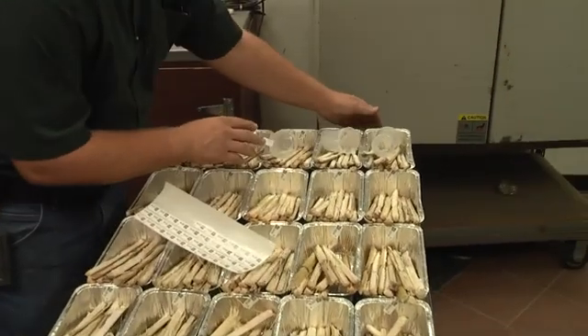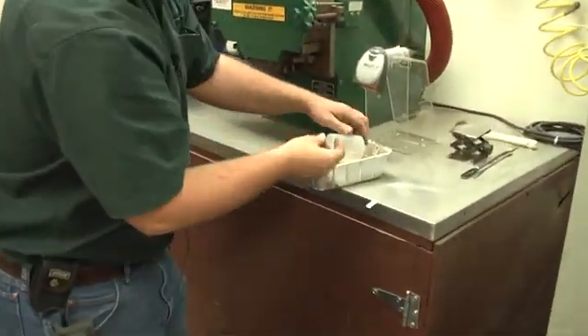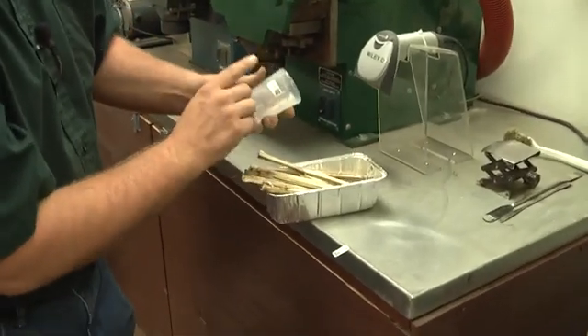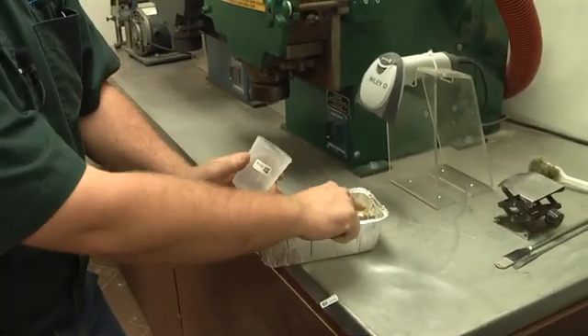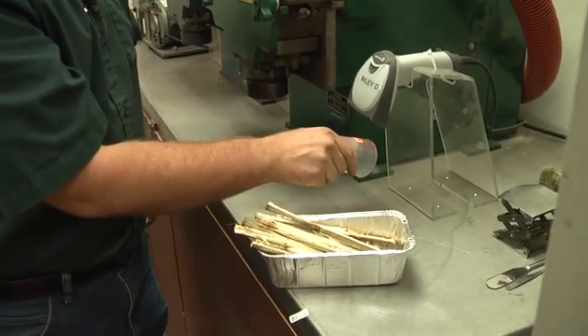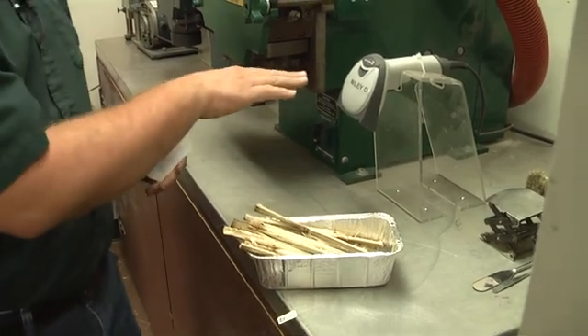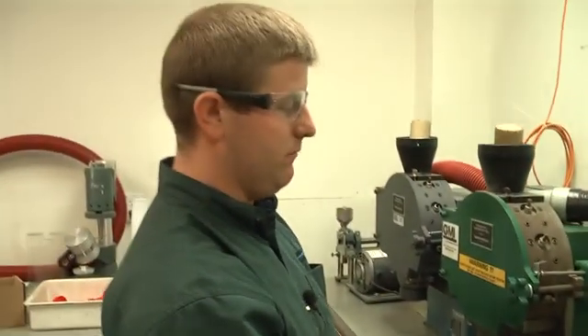What we're going to do now is pull the samples off the tray. We are going to sticker them with a new barcode so that this in-house lab number now matches our PAN lab number. We're going to scan it into our system that it went through Wiley D. What happens now is in our computer system it's going to say my name, Craig Abel, scanned this particular sample, time, date, and which grinder it went through.